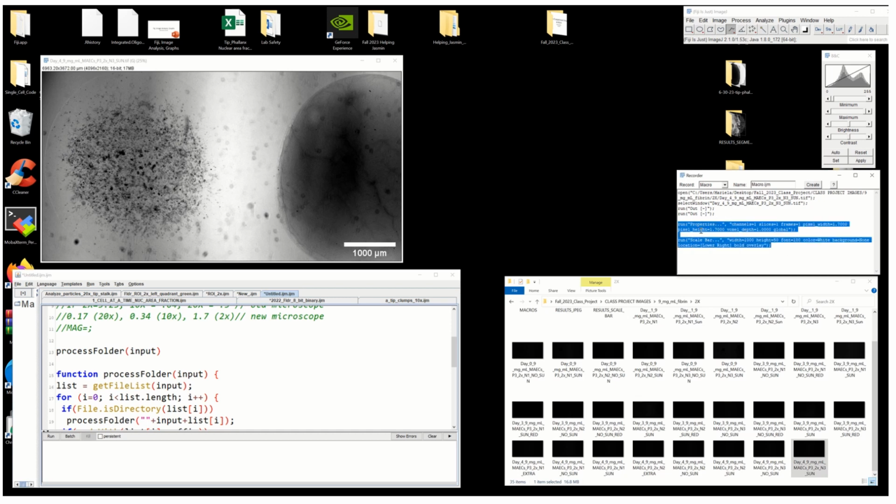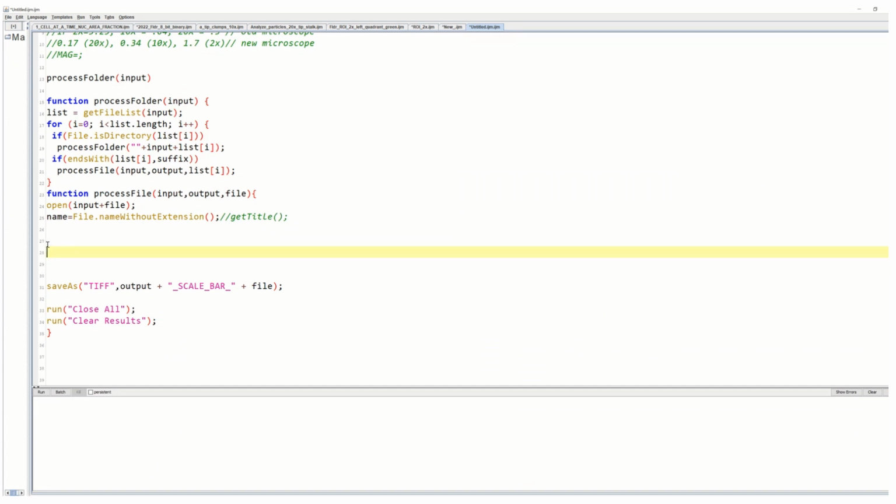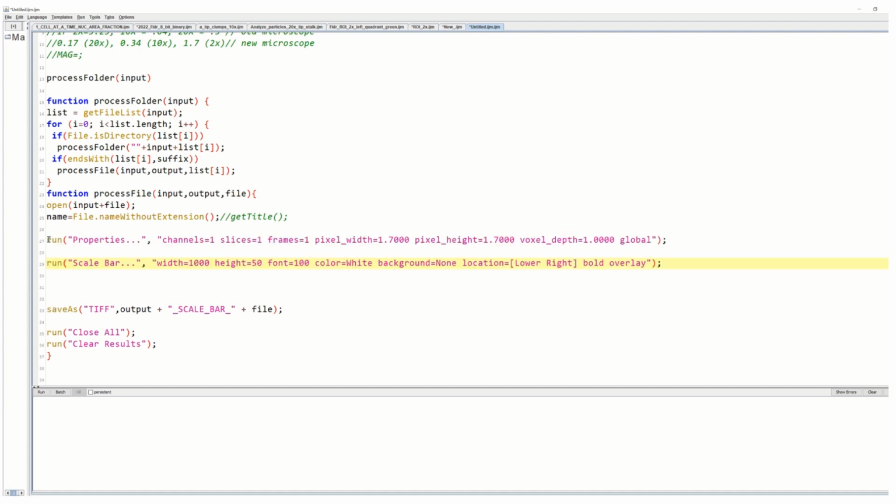Now in class today, some of you didn't take all the code. You missed a line, or half a line or something. Even if you miss a colon or a semicolon, your code will crash. So make sure you are very, very careful about how you take everything. So Control C to copy, and then I like to make this big so that I can see better. Basically, right after this for loop, that's where I paste my recorded code. This is what I want.